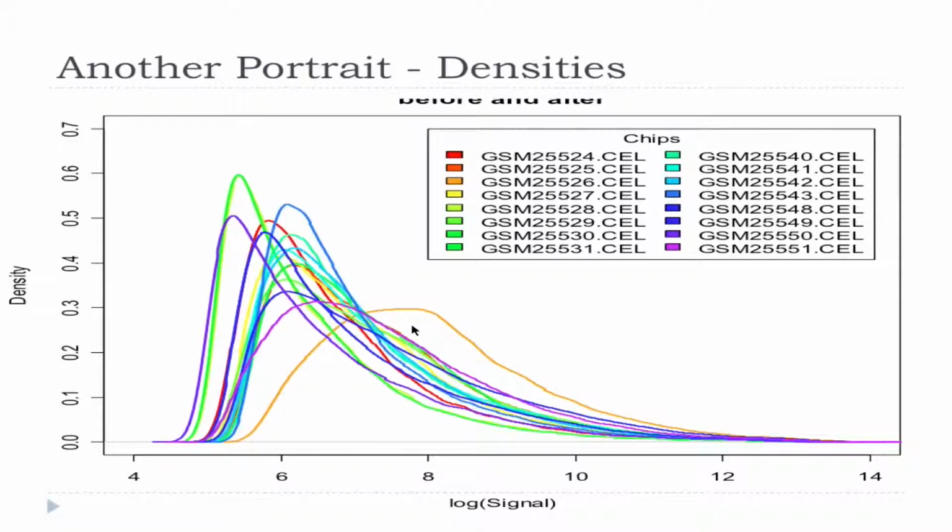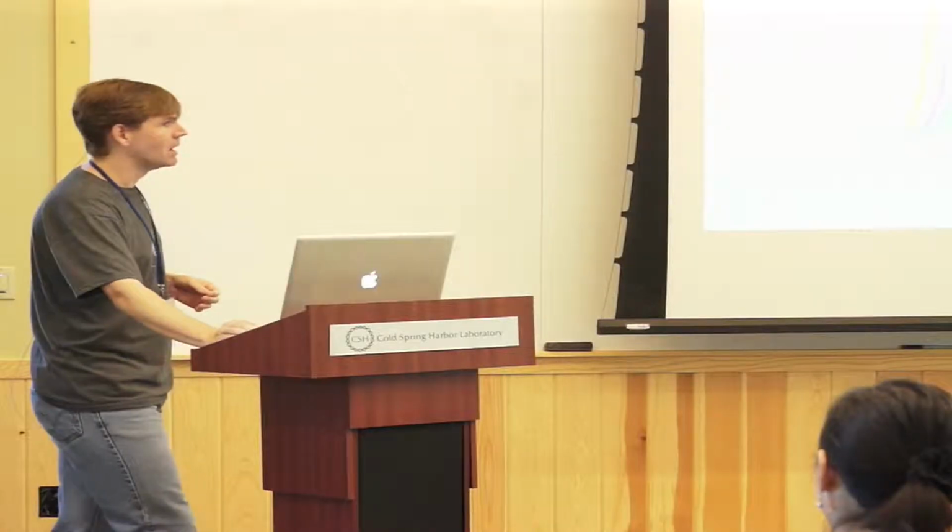Sometimes you can't tell, and you just say to your biological collaborator, or if you're doing them yourself, you just do the array again, if you're not sure. But this may be the one mouse out of your 6 back crosses that produced the phenotype of interest, in which case you might not be able to remove it. You just never reproduce it. So I agree with Naomi. In all of these plots, you're looking for problems, but just because you see a problem doesn't necessarily mean that you can start willy-nilly throwing things out.